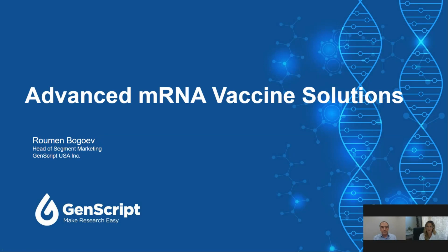Excellent. Our next question. What is the amount of plasmid that your instrument can purify per sample? Okay, very good question. There's no real cutoff of what we can purify and cannot purify with this instrument, but the performance of the instrument, the purity and the yield, is the highest in the range of 300 micrograms to 1.2 milligrams. Again, it doesn't mean you cannot purify lower or higher. It's just that the yield or the purity may not be as high as if you're in this range.